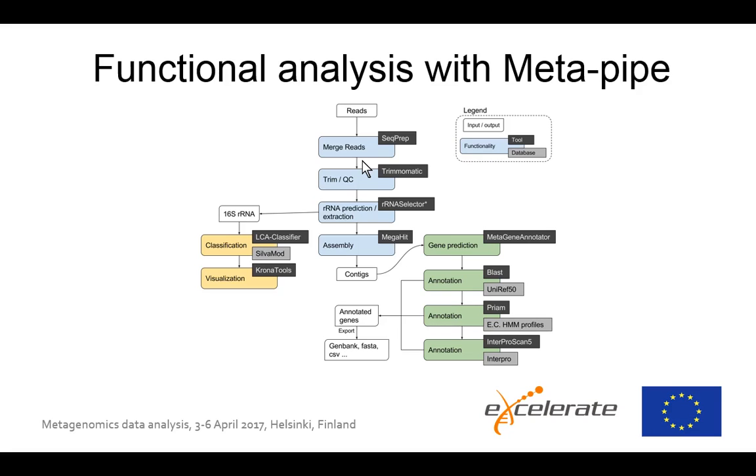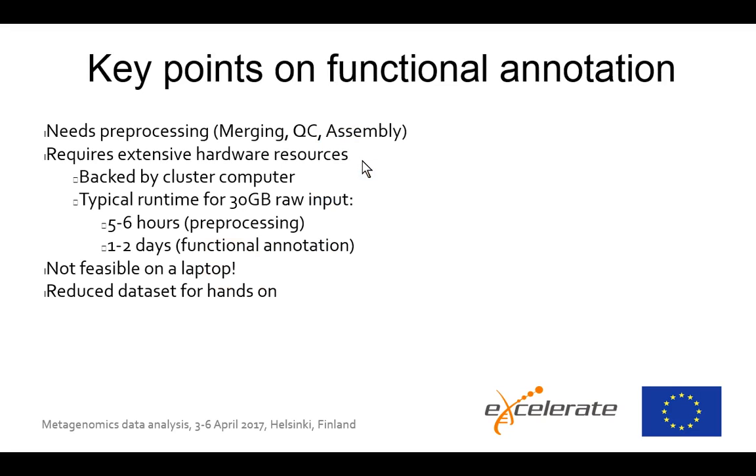So we're going from contigs, gene prediction, and we have 3 different annotations. InterProScan, you probably heard Rob talk about that this morning. That's a collection of 14 different databases. We have enzymes specifically, and there's a BLAST against UniRef. And then in the end, we'll get the GenBank. But for today, you're only logging into the site and basically submitting your files.